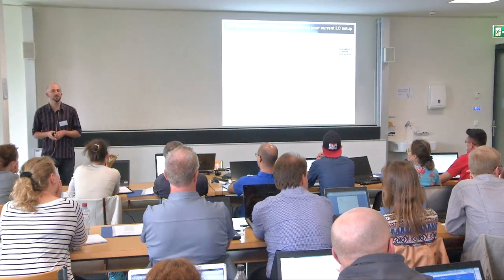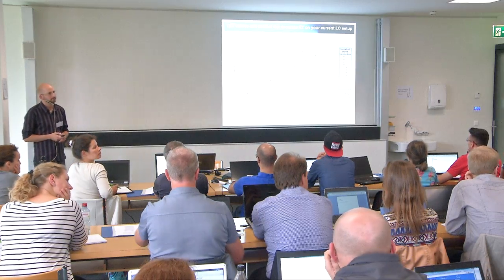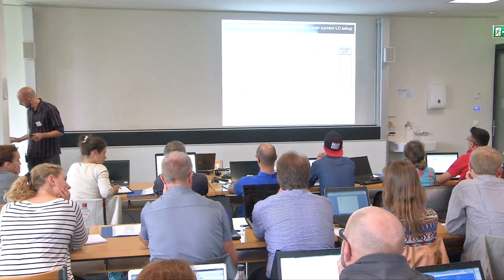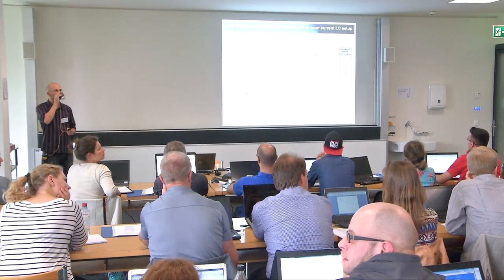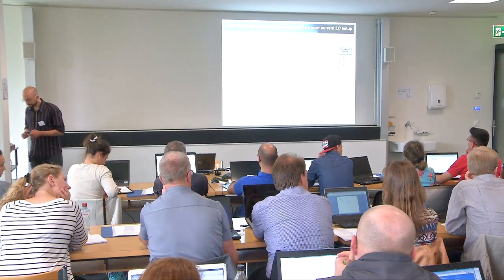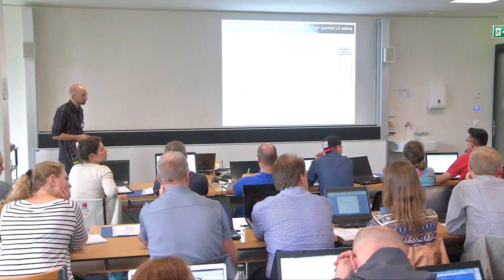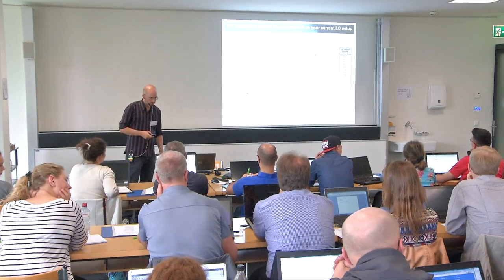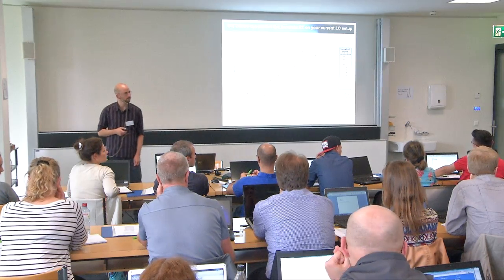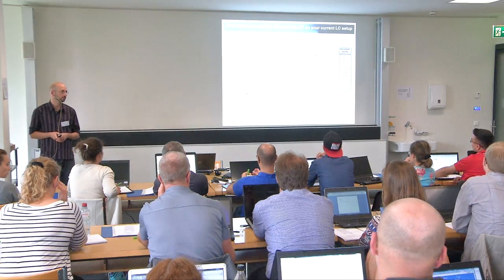Anybody has a suggestion why? Exactly. It all depends on how these iRT values of the standards are defined. What the Biognosys team did is they actually defined the second eluting peptide as 0. Not the first eluting, but only the second. This is why this whole scale can also get negative at one point. It doesn't mean something is wrong, it doesn't mean it didn't work. It's just the scale that we defined at the beginning. iRT values, yes, can be negative. Not in this case.